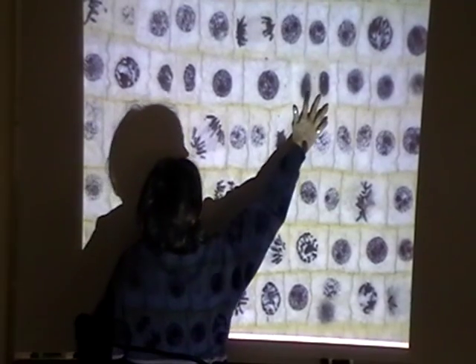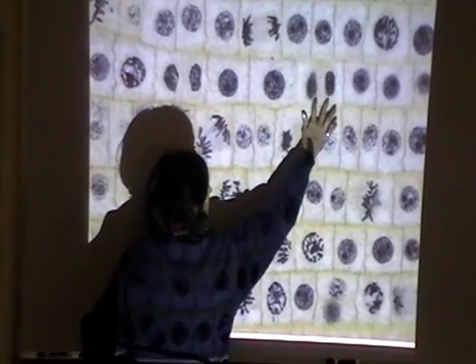And then the last one is we have some telophase, where this one is just about ready to cleave completely and make two daughter cells. And here is one where you can tell — two daughter cells.